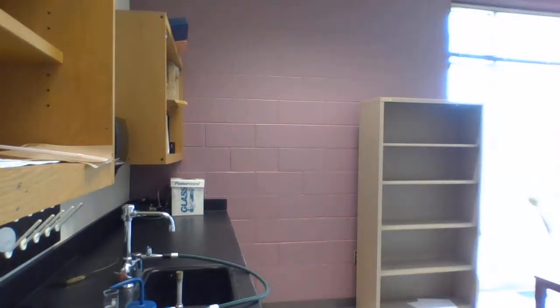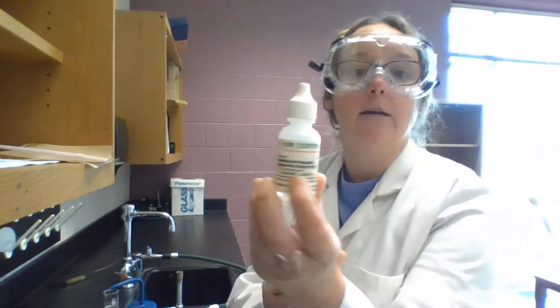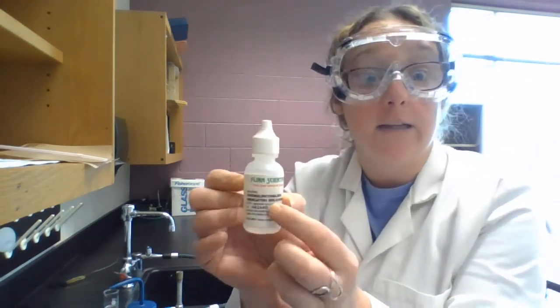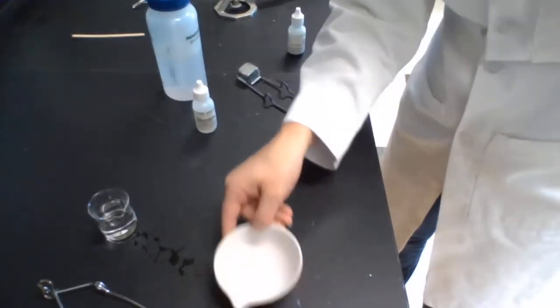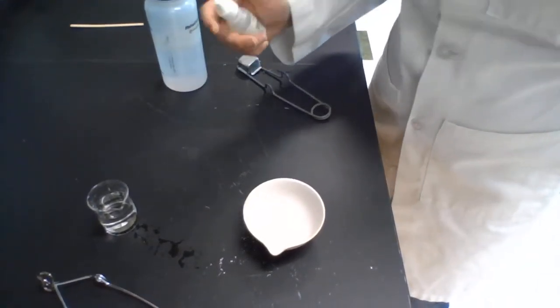And in order for us to determine if it did in fact produce a base, we are going to use some phenolphthalein. All right, so I have some phenolphthalein here. Now, phenolphthalein turns bright pink in the presence of a base. Okay, so let me readjust my camera here. All right, and let me put in some phenolphthalein.